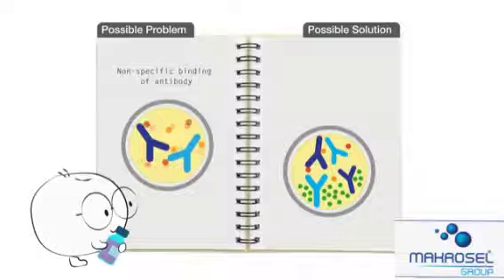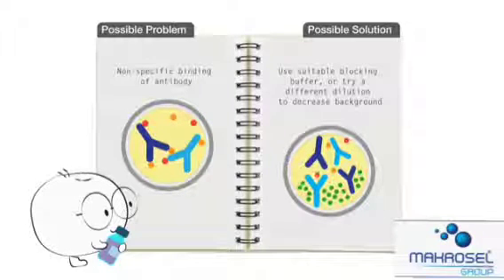High background may also be due to non-specific binding of the antibody, therefore you may want to try using a suitable blocking buffer or a different dilution factor to decrease background.